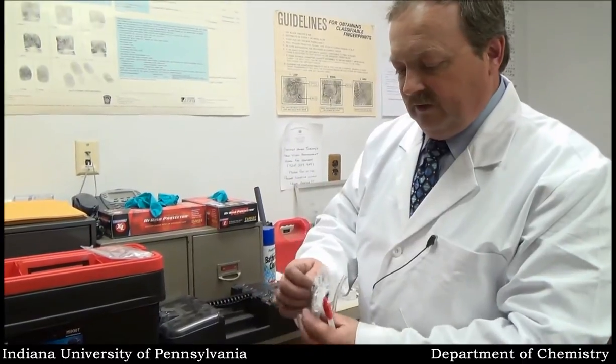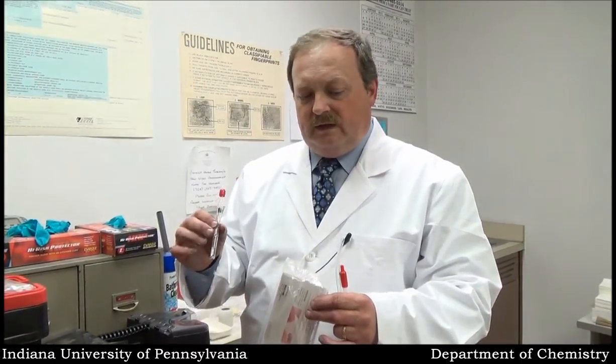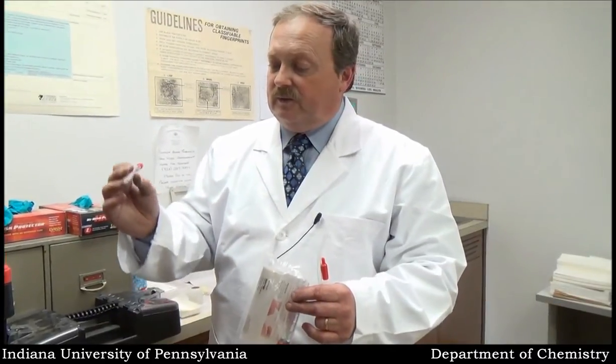I'm going to get one of these ready because I'll need it in a minute. This is basically a chemical that will set the iodine print, because the iodine print will initially appear yellow and it will fade rapidly. So if we do identify an iodine print, we are going to apply some of this to it and it will turn it black and set it permanently.